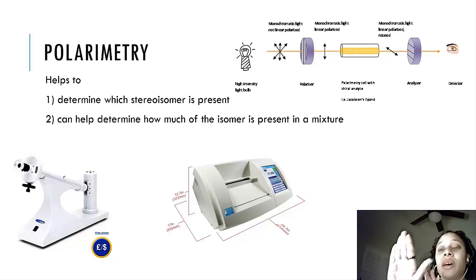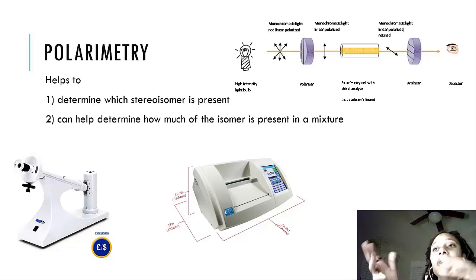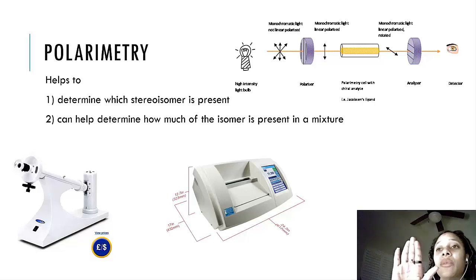It puts a material or a film, or in some cases an electronic thing, that keeps light going in only one direction. If light's moving in all sorts of directions, how do you know how it affected the light? So if you keep it one way, you can measure if it goes one way or the other. Can it go to the right? Can it go to the left? And how much does it do that?